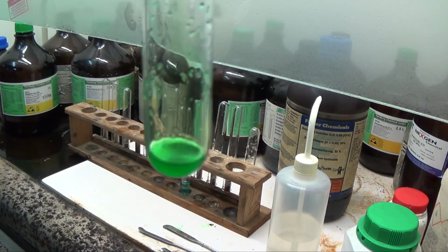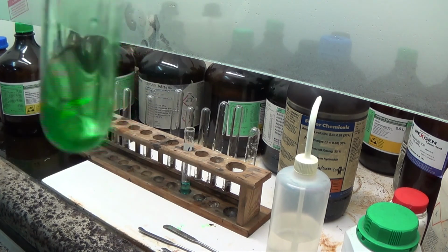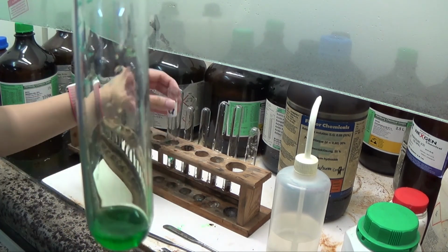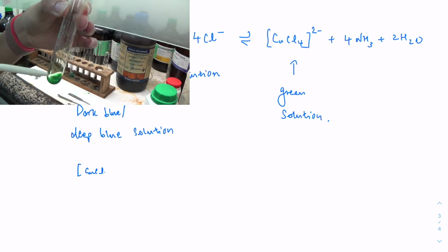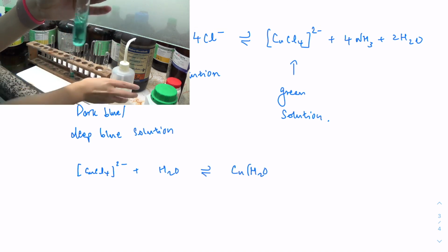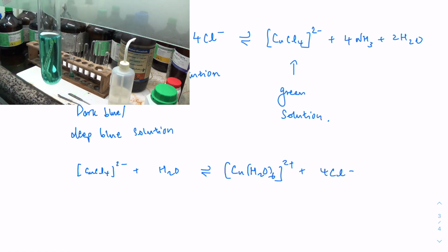Okay, just like when we added concentrated hydrochloric acid to the pale blue solution containing the copper 2 plus with a lot of H2O just now. But if I dissolve this in a lot of water, so if I add a lot more water to this, which is CuCl4 2 minus, this is the idea of reversible equilibrium. These are all to do with ligand substitution.